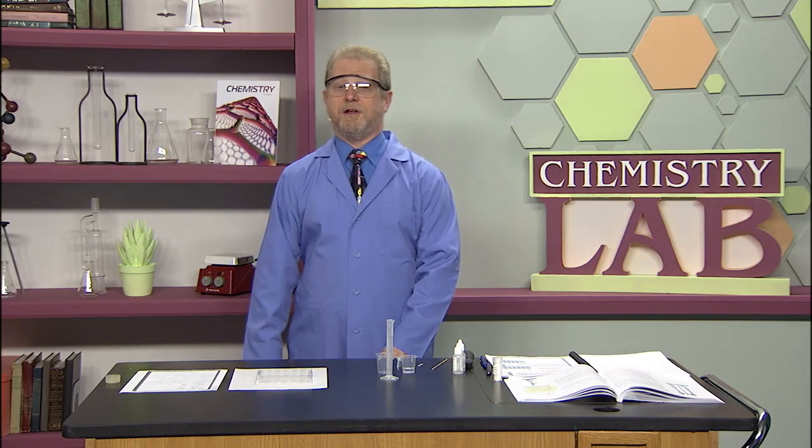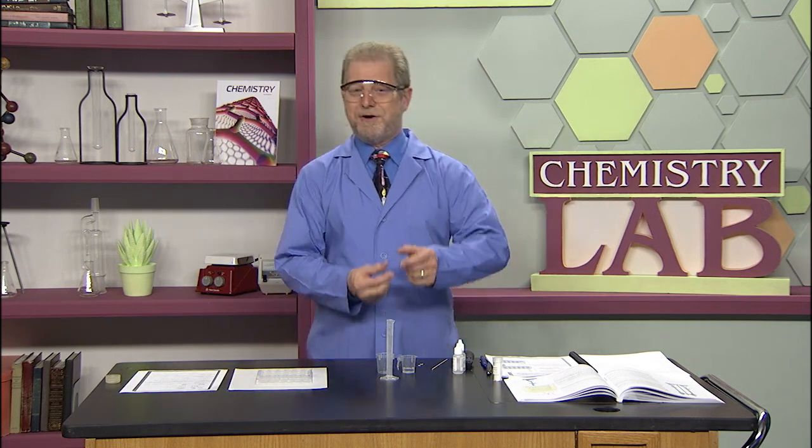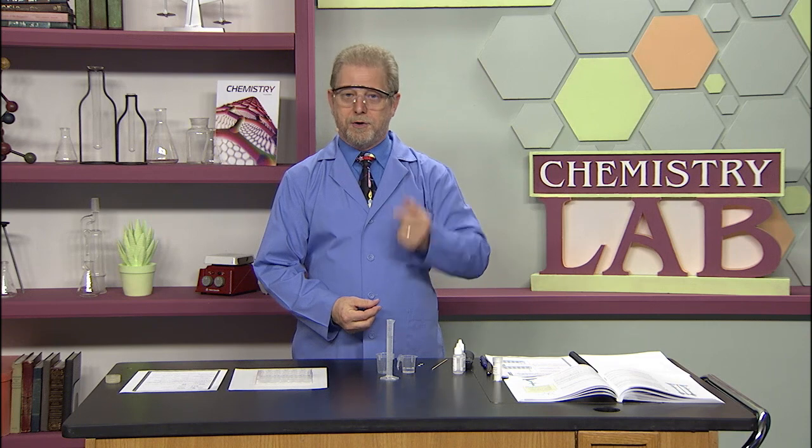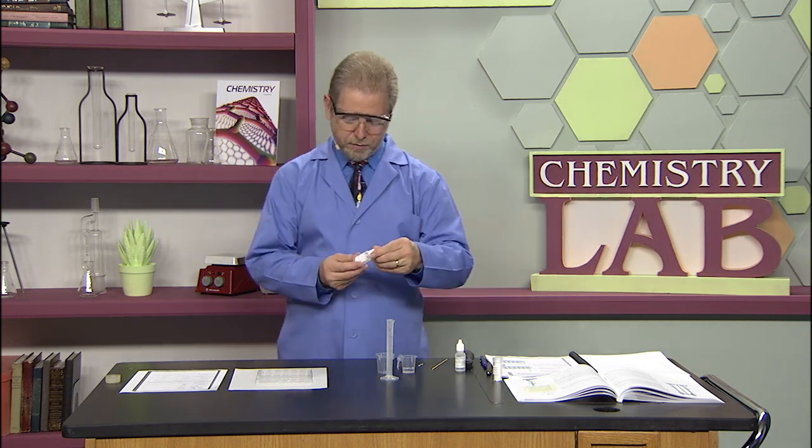I'm really excited about this lab, we get to do a titration. I've wanted to do this but you'd have to go out and buy a $50 burette and I knew that's not gonna work. But what we do is basically just use the droppers as the burette.